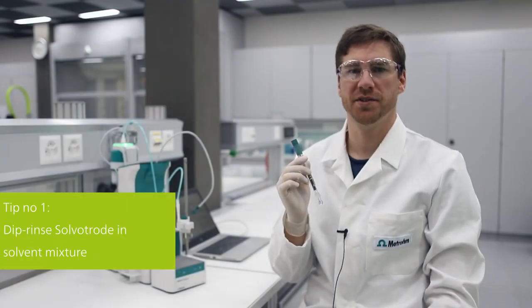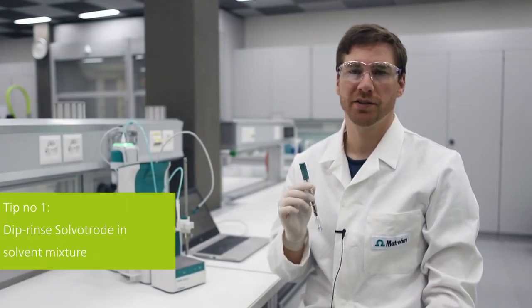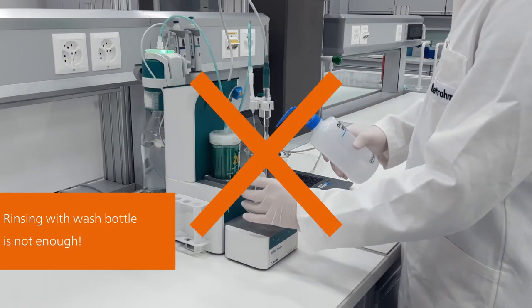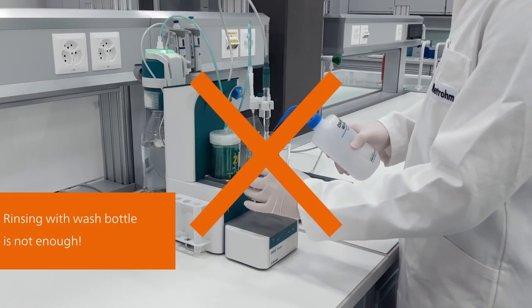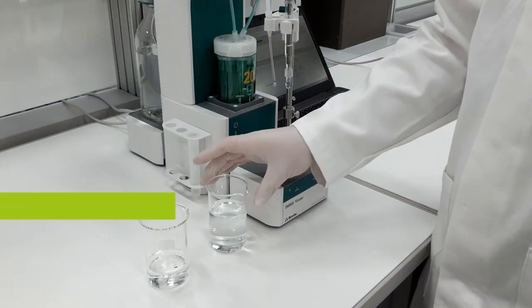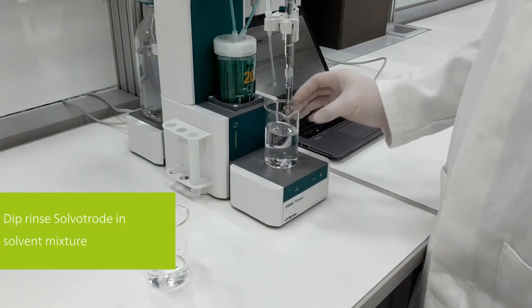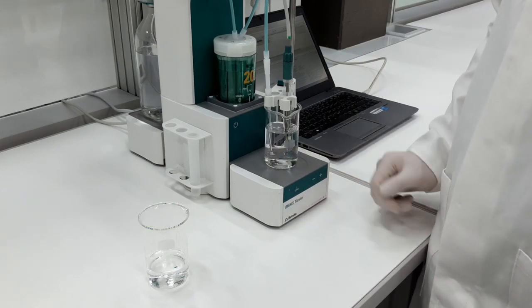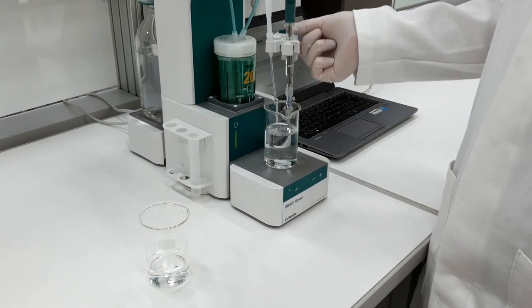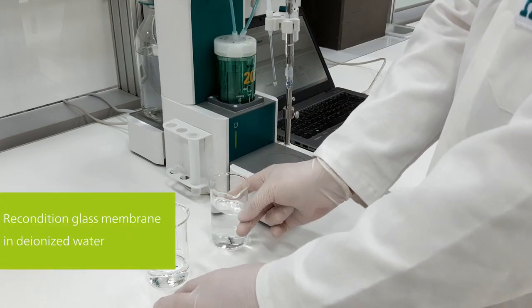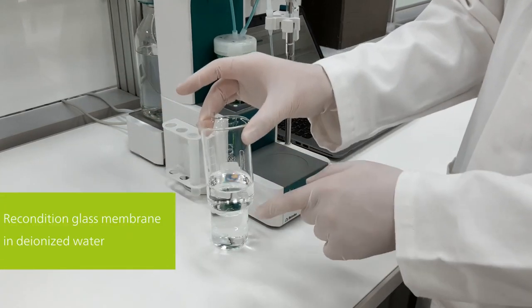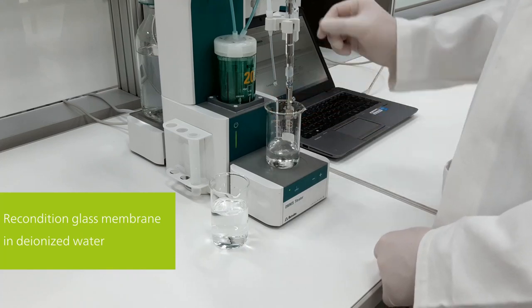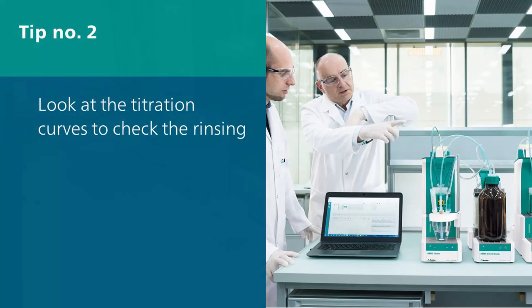Here is my first tip for proper cleaning: dip rinse your electrode. Rinsing with a wash bottle is usually not enough to remove the sample. Dip rinsing means immerse your electrode in a beaker filled with solvent and keep stirring for one to three minutes. After this, do not forget to place the glass membrane, and the glass membrane only, in deionized water to recondition it. Make sure that conditioning time is long enough.